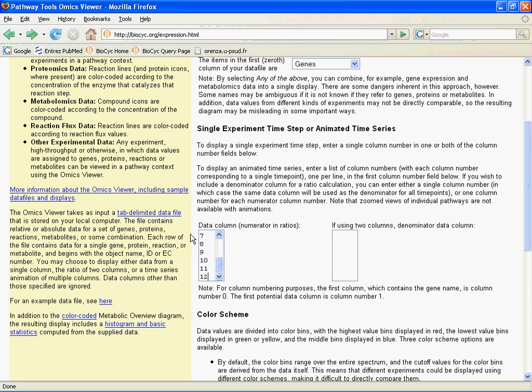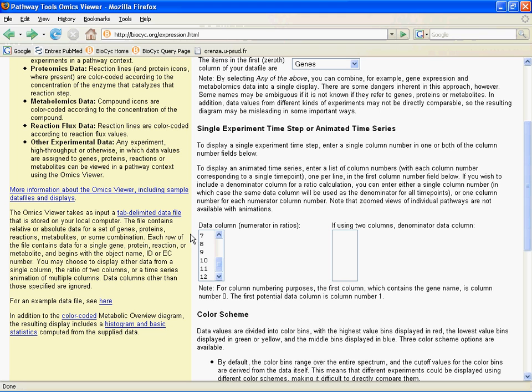So we're looking at twelve time points in this case. Now I'd like to emphasize that just because it's an animation doesn't mean it has to be a time series. The animation tool provides a way to compare things with the color ranges set to the same way, and so you can click back and forth between them.